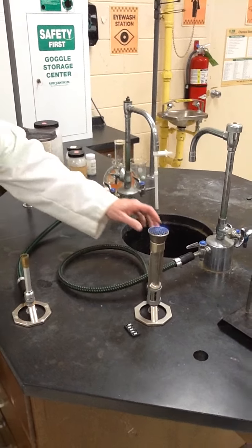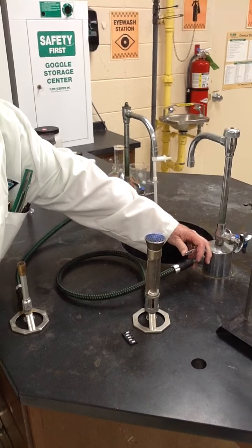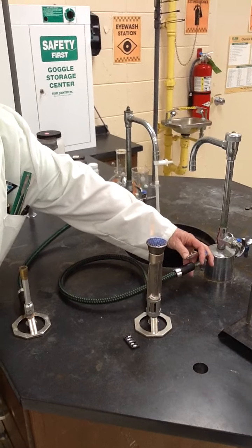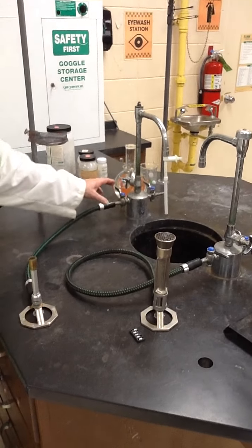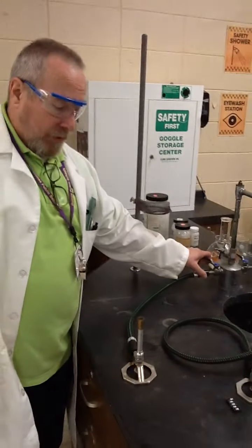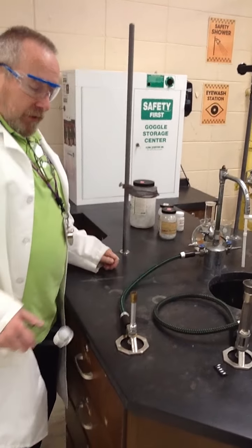Okay? That's a Fisher burner. Burns very hot, has a big broad flame, and is wonderful for a variety of uses in the lab. But today we're going to use something more traditional like a Bunsen burner. This is technically a Tirrill burner because of its adjustability.